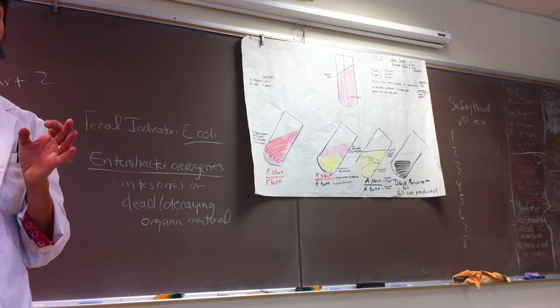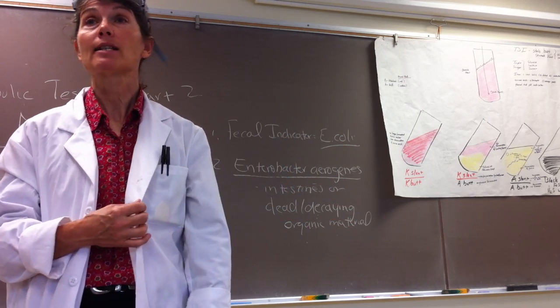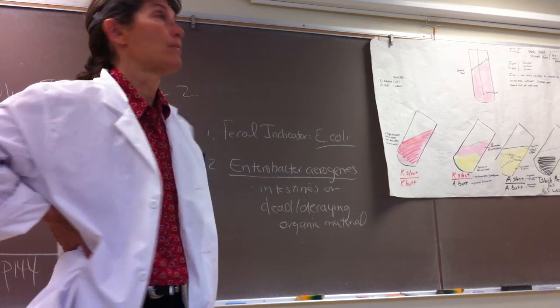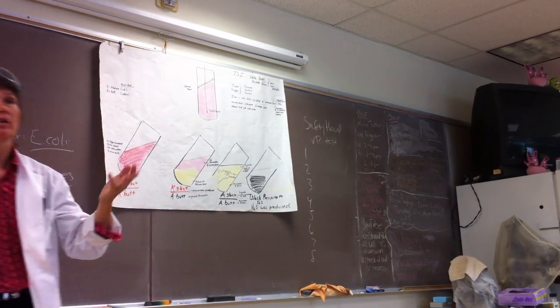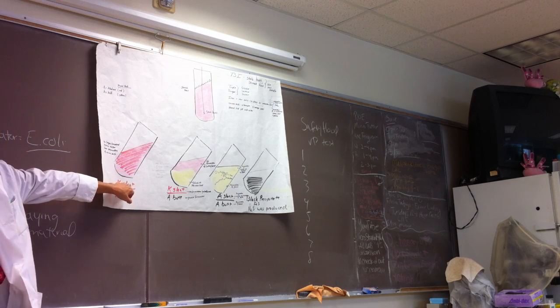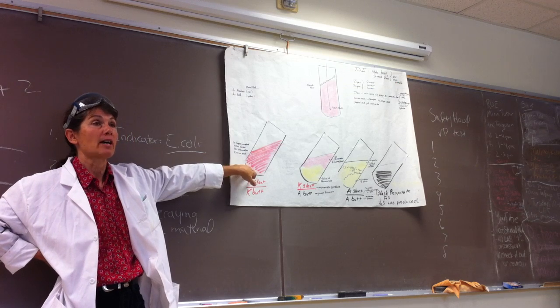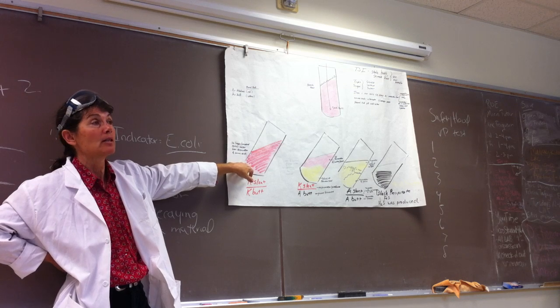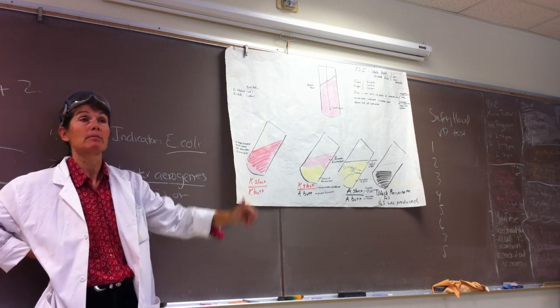And the phenol red will let us determine if those sugars were fermented, right? So if the sugars are fermented, they make acids and the pH drops. What color does the phenol red turn? Yellow. Good. Okay. So let's look at the colors of phenol red and see there's three different possibilities. If your organism cannot ferment any of the sugars, just as we saw in the PR sugar fermentation, they'll use the proteins, the amino acids, as an alternate source of energy. And when organisms are breaking down amino acids, the amino group gets released as what? Ammonia, right? And we know that's a weak base. So what happens to the pH?